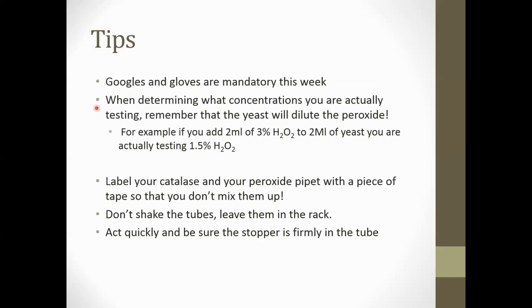You're going to need to wear gloves and goggles this week. Remember, we're producing gas under pressure, and occasionally test tubes will crack or burst, and we want you to be safe. You're going to need to label things very well this week and not mix up pipettes. The pipettes that are used for yeast have to be different than the pipettes you use for the peroxide.